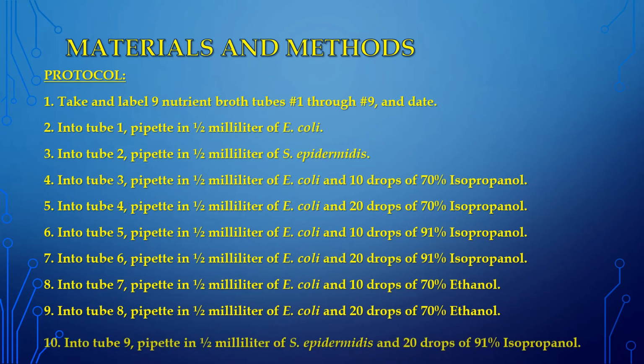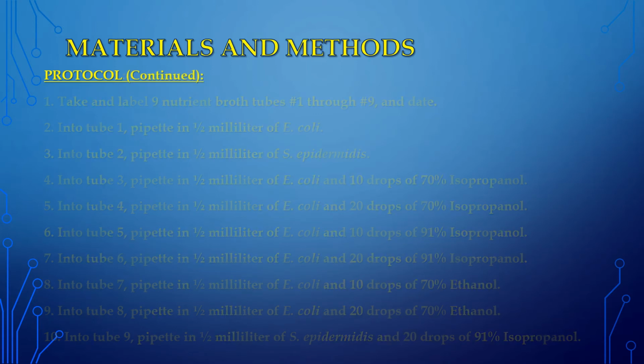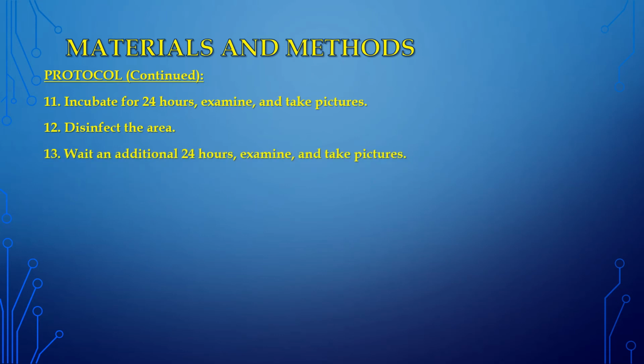And into tube 9, pipette in a half a milliliter of S. epidermidis and 20 drops of 91% isopropanol. Incubate for 24 hours, examine, and take pictures. Disinfect the area. Wait an additional 24 hours, examine, and take pictures. Wait an additional 24 hours, examine, and take pictures.